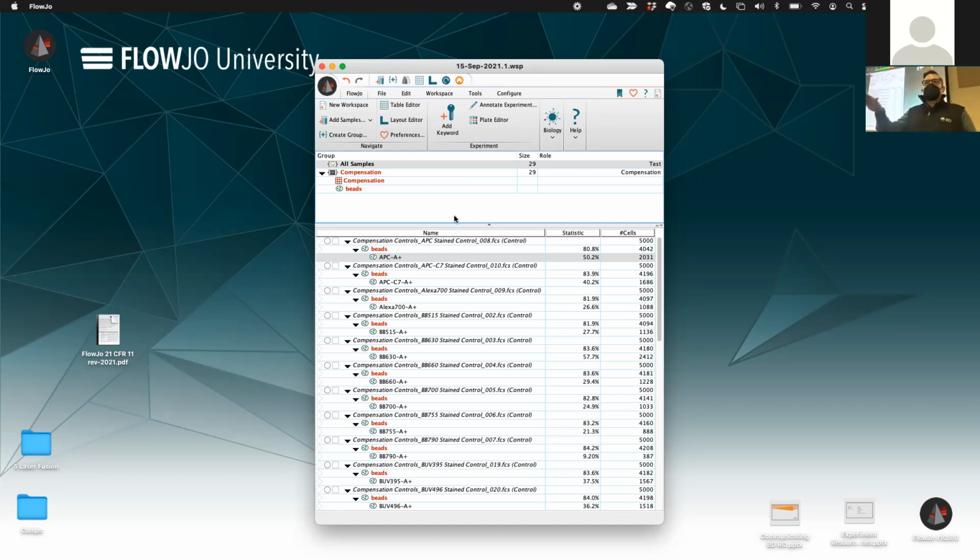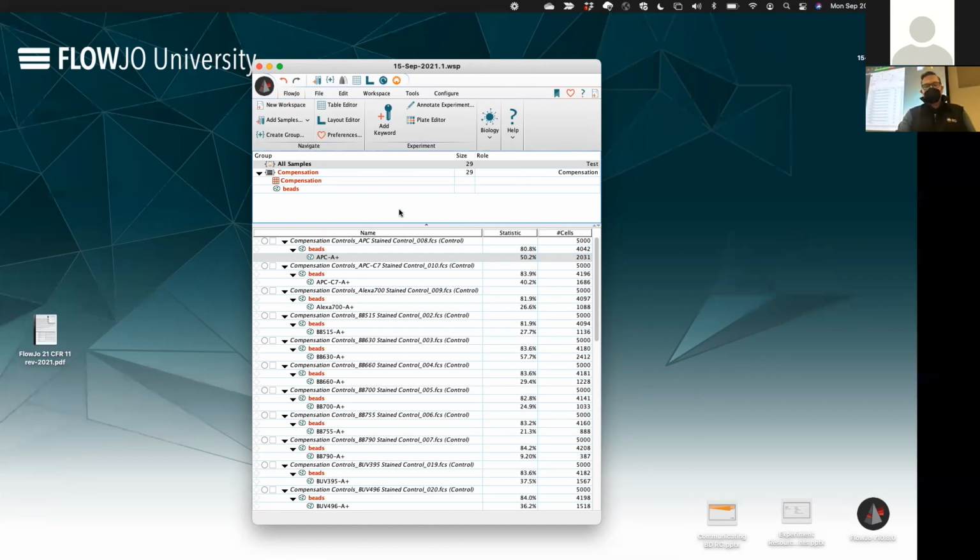So that project went underway, and then they were purchased by BD, where BD said there's a lot more pain points that we can solve via the cloud. And so we wrote down all of those pain points and made the cloud features in FlowJo.